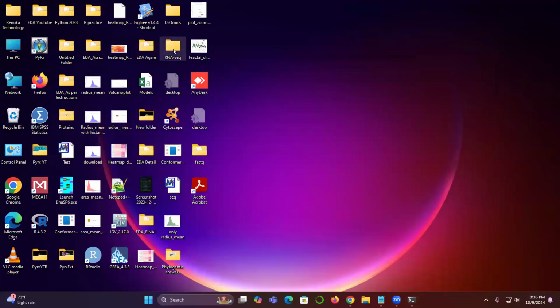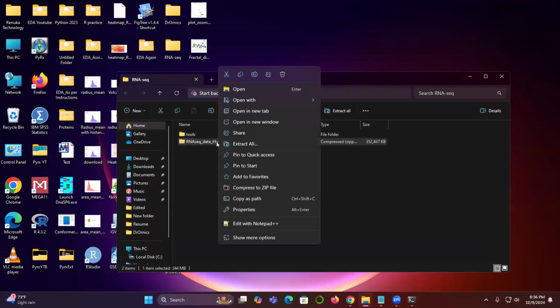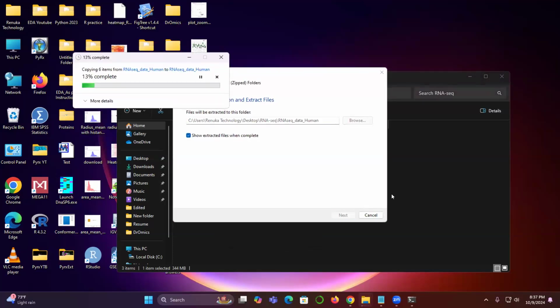Open that. Yeah, I can see this is in the compressed format. Select this. Right click it. Can you see that extract? Extract all. Yeah. Extract. Make sure everyone is having the extracted file, because for the compressed file it will be difficult otherwise later on.